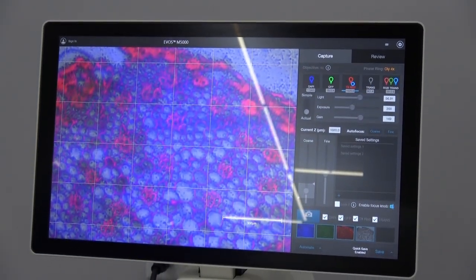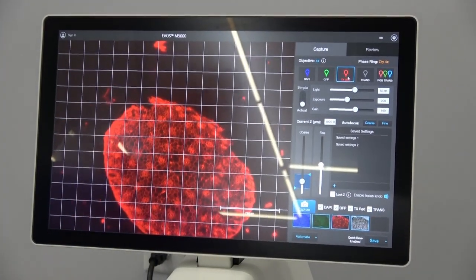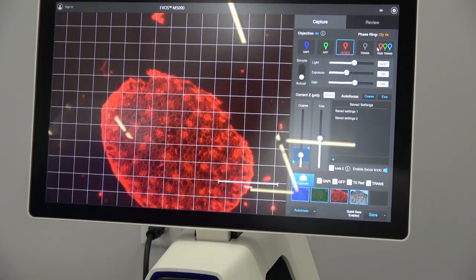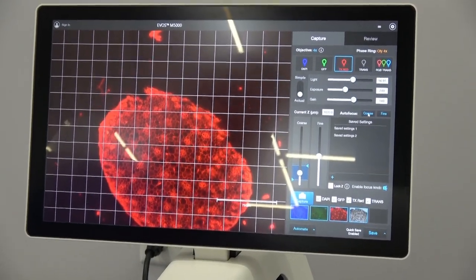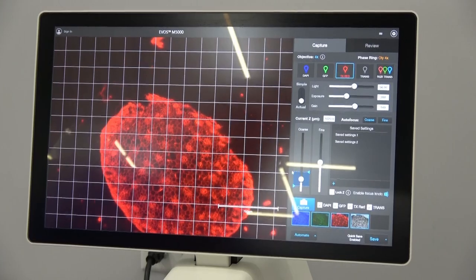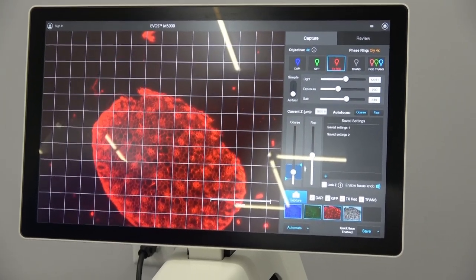I can select my color I want to view that through. I can have it do an autofocus set up within a focusing window.